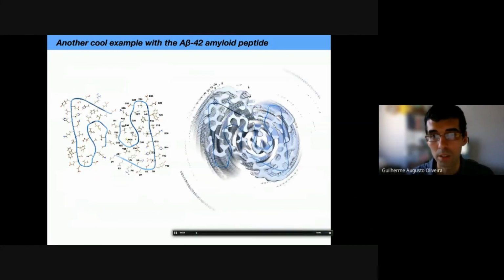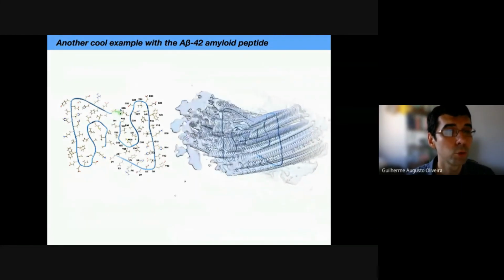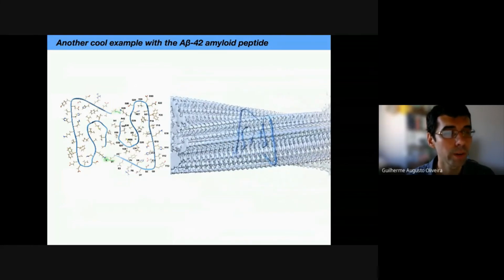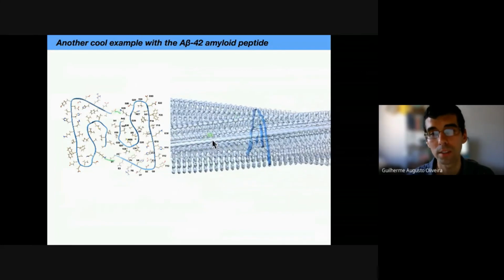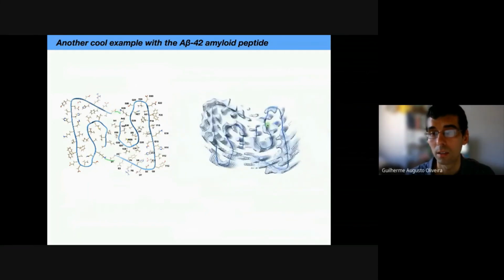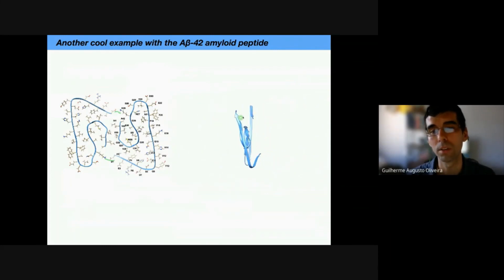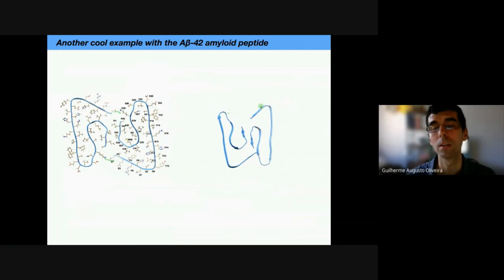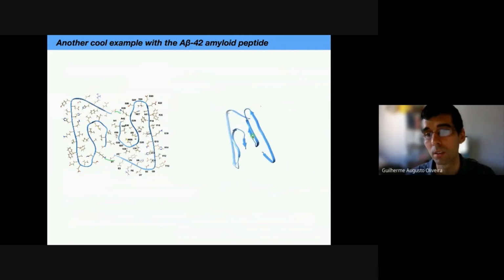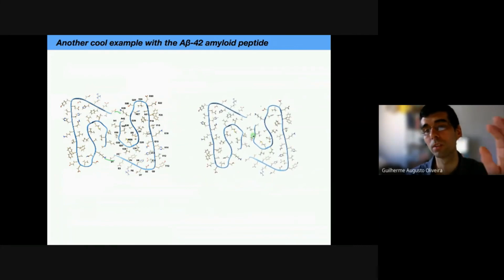It's very nice to understand this type of fiber, because the 2 protofilaments, the left one and the right one, are held together by an ion pair, this salt bridge here. So you can see in this video the densities. And it's also nice to see that the 2 protofilaments, this one protomer and the other protomer, are staggered, one from the other, and it's pretty clear in the last frame of this video.